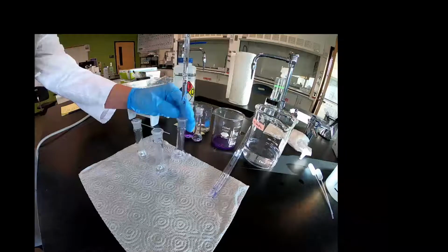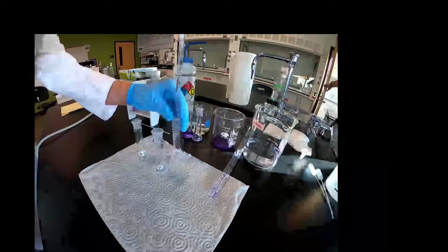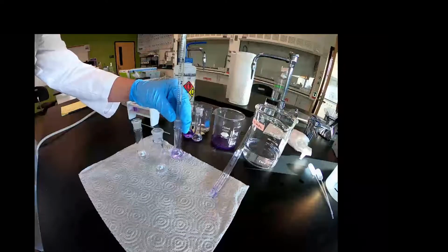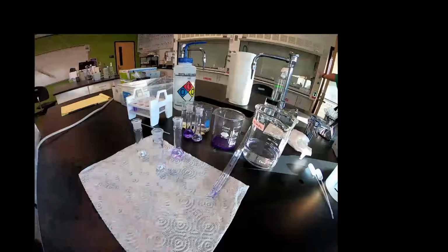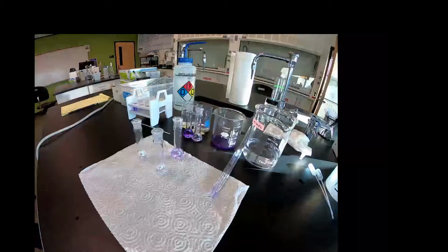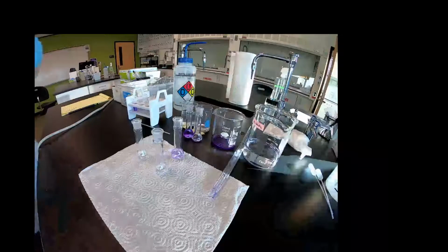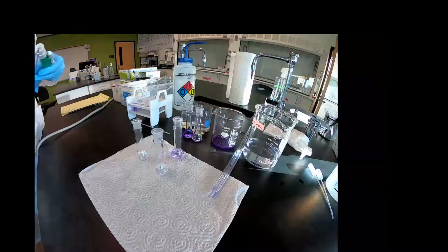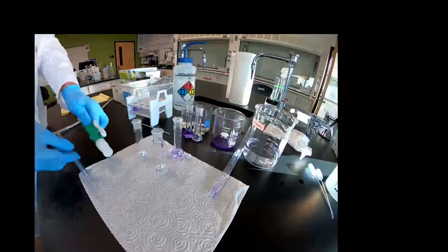this will work. Now we're going to measure out samples 4 and 5. Plus it'll be interesting to look at the calibration curve. So it may or may not affect R squared. Usually these kind of errors start to show up in the R squared. You start to lose 9s, as we say. But we'll find out. Still may be suitable for our purposes.